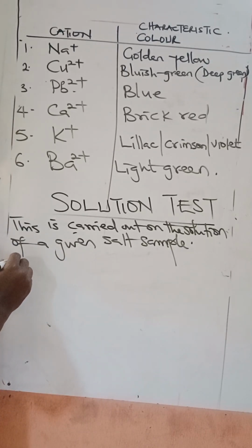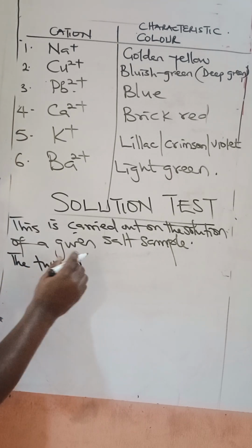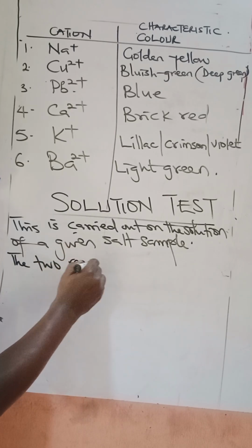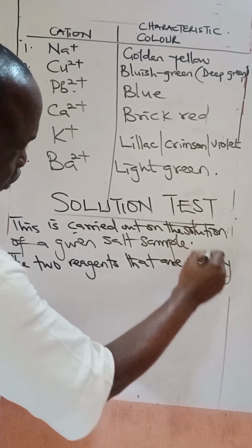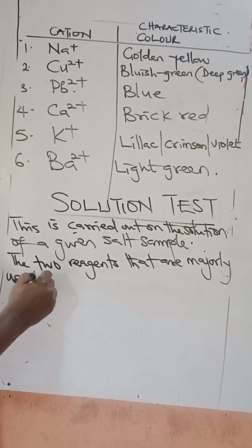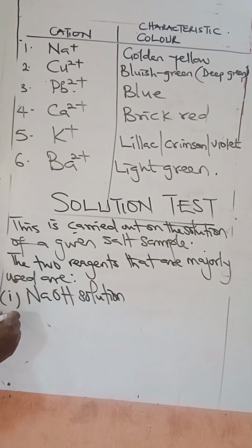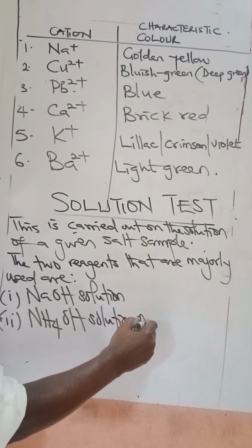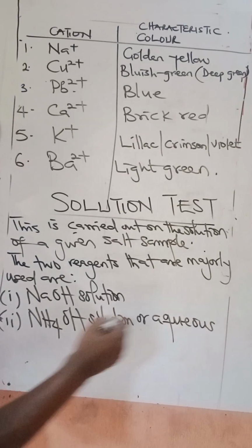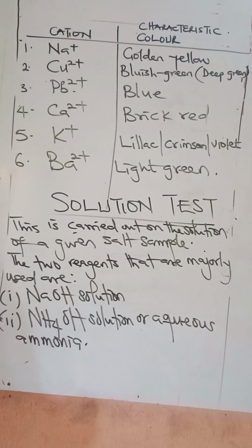Now, the two common reagents that are majorly used for solution test are, one, sodium hydroxide solution, and then ammonium hydroxide solution, or you call it aqueous ammonia. These are the 2 major reagents that are used to carry out solution test.